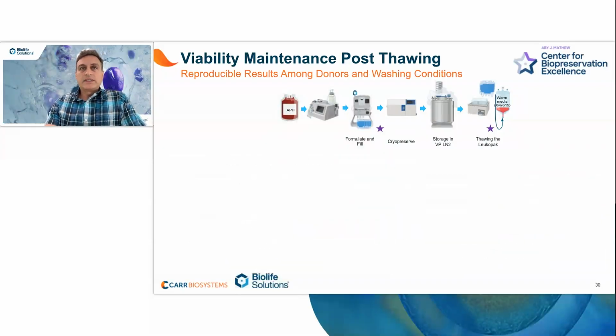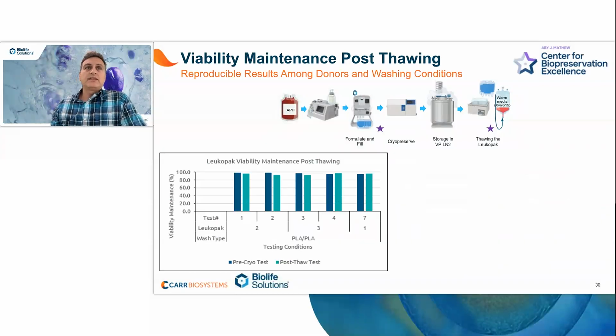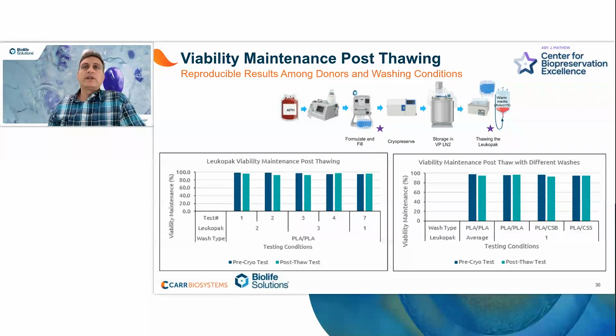These are viable recoveries. If you look at the viabilities, same story, very minimal impact to viability. Even with the test 4 where we had some loss of the cells, that does not necessarily mean we lost viability. Viability was maintained really high.